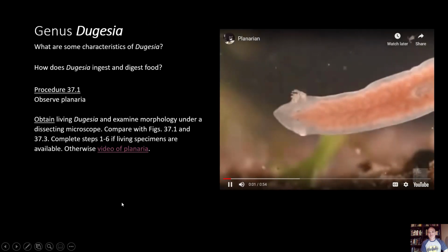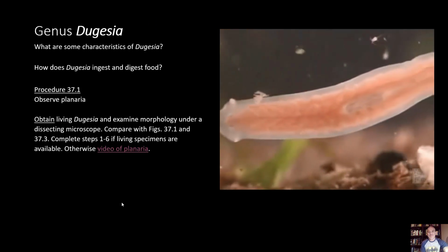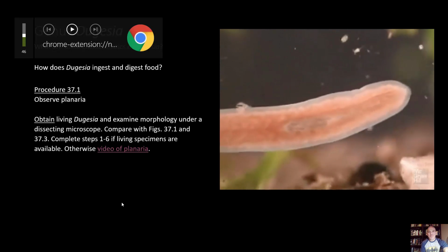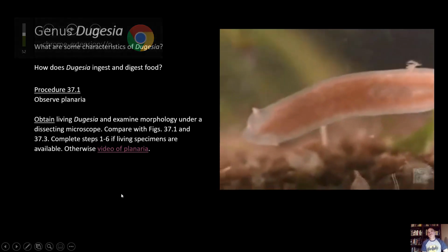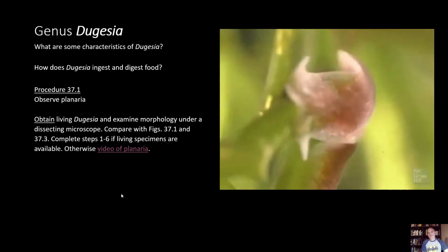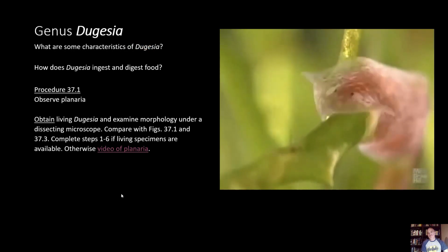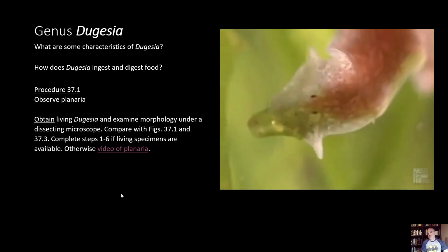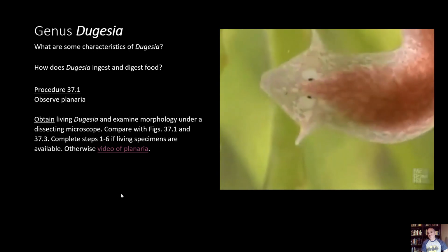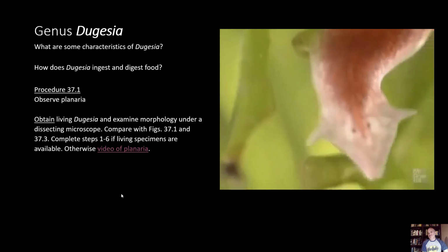It is in flatworms like Planaria that we first see bilateral symmetry and cephalization, the localization of the sense organs in the head region. A pair of ocelli, light-sensitive eye spots, are located toward the center of the head. Lobes extending from either side of the head contain chemosensory cells.